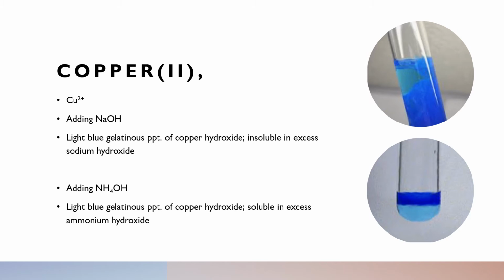For copper 2 ion, Cu2+, when we add NaOH, the precipitate formed is blue, and it will not dissolve in excess NaOH because Cu2+ is not an amphoteric.